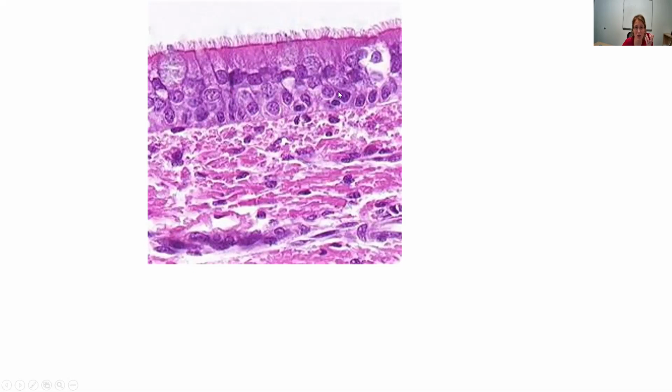This is not the most awesome picture ever, but I can see that some of them are. But my other key is all of these little cilia. I don't recall anything about plain stratified columnar epithelium being ciliated, but I do recall pseudostratified ciliated columnar epithelium. And so that helps me know it's the pseudostratified.